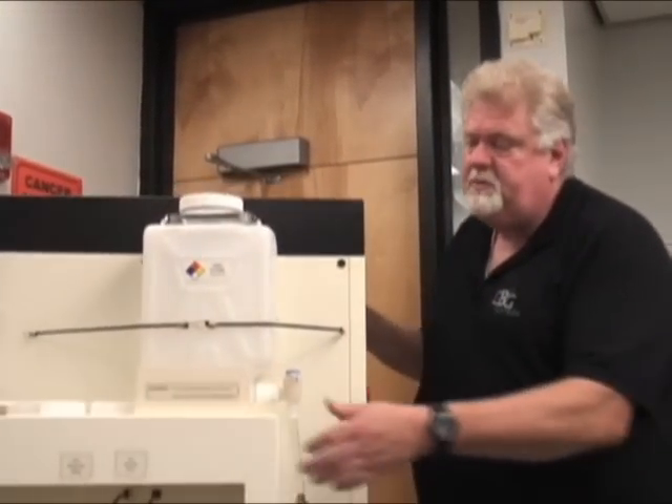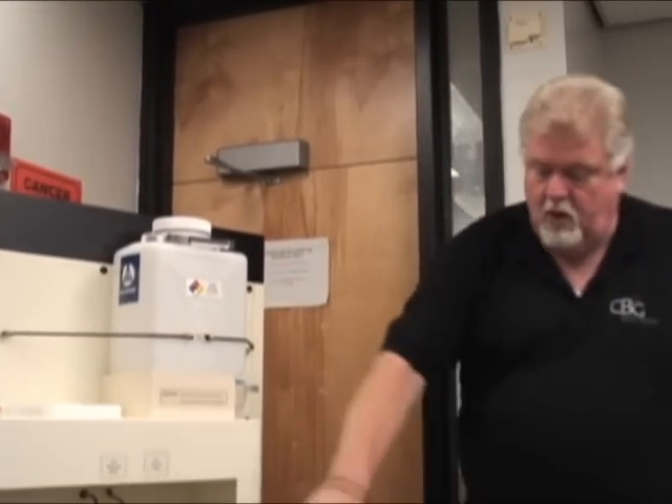Also with the portability of this machine is total spill containment. The trough at the bottom is a spill containment trough and will contain a spill. This unit has no pressure or vacuum — it's a completely gravity-fed system. Very benign, very safe.